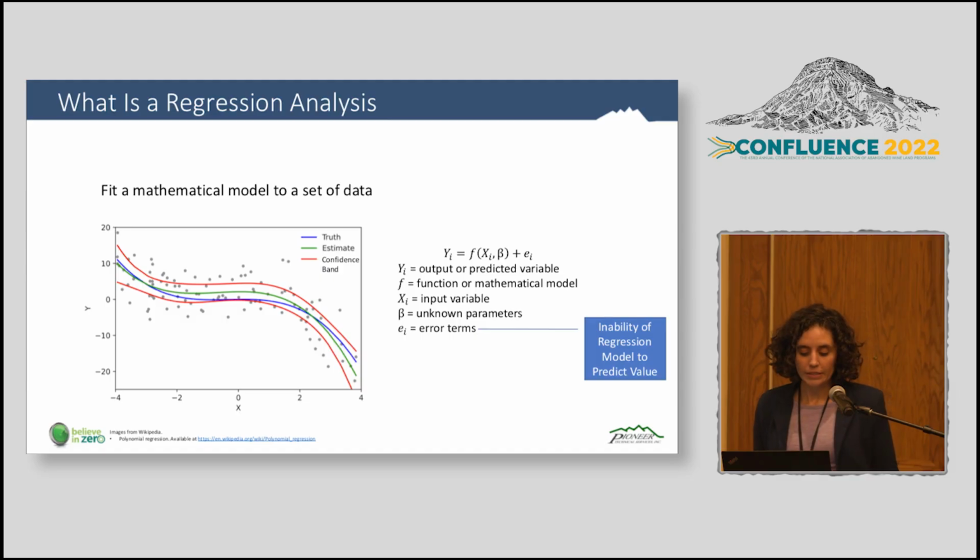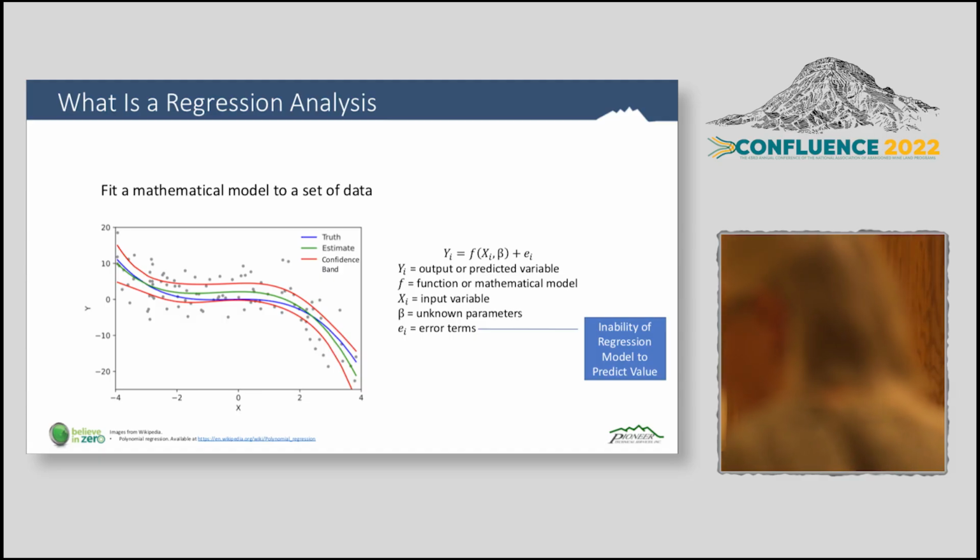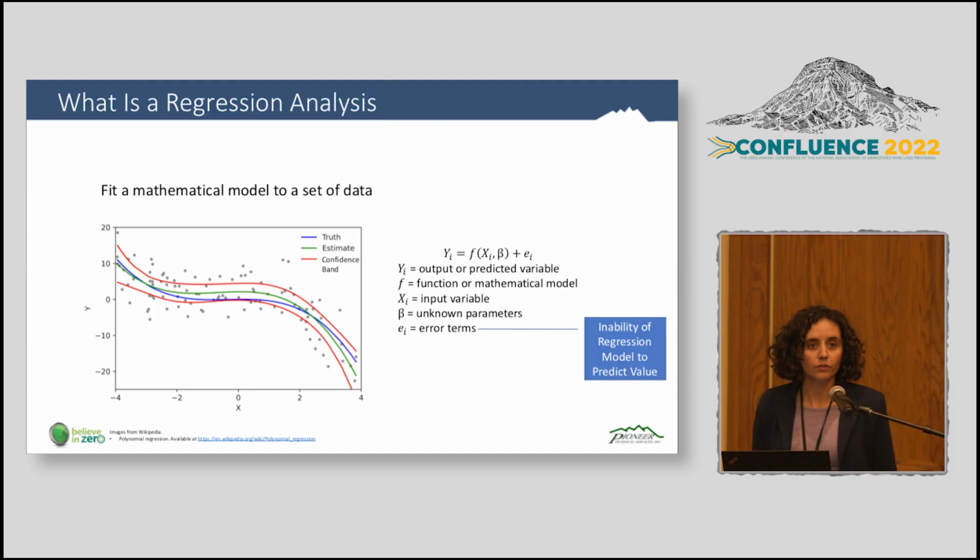So in this instance, we're trying to fit usually a linear model to our data set. Here we have a scatter plot with our XRF concentrations on the x-axis, our laboratory ICP concentrations on the y-axis. And we're trying to come up with a mathematical model that predicts what future concentrations could be.